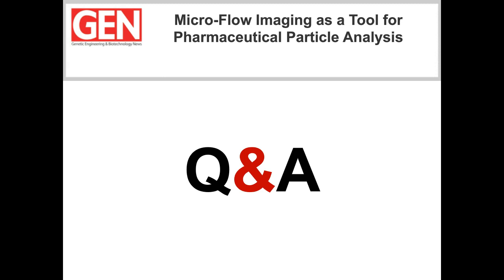Yeah, so we have two different MFI models. There's the MFI 5100, which Miranda used in her study, which analyzes particles in the 2 to 300 micron size range. We also have the MFI 5200, which analyzes particles in the 1 to 70 micron size range. So that's the more sensitive model, and the lower limit of that is 1 micron.